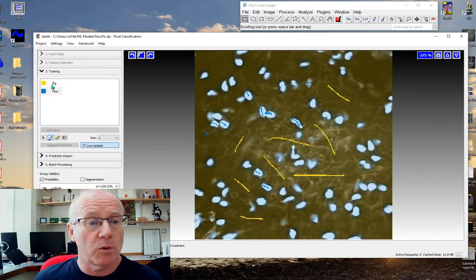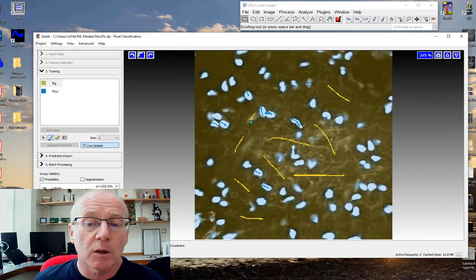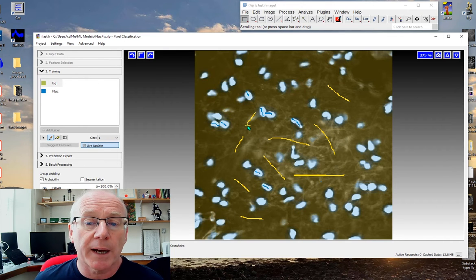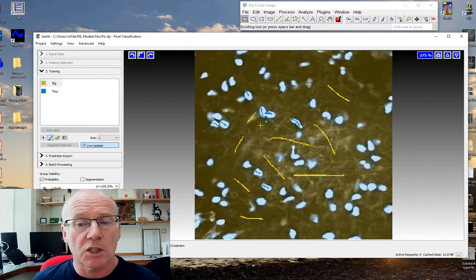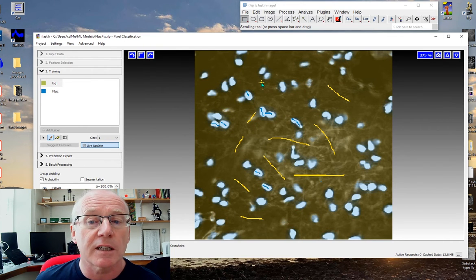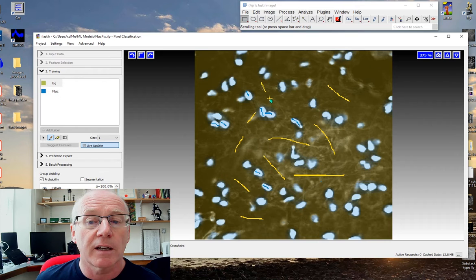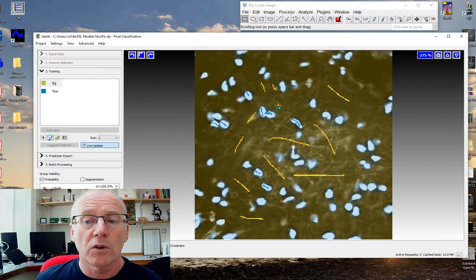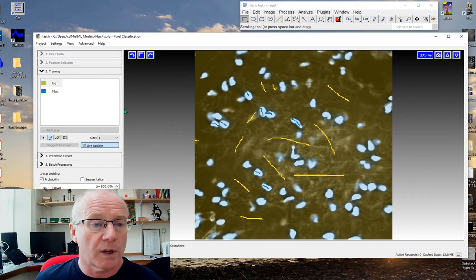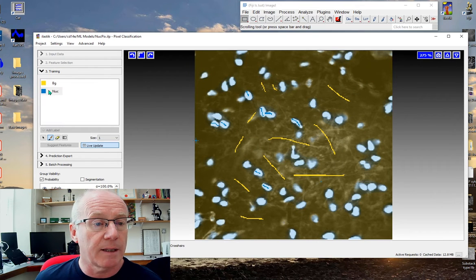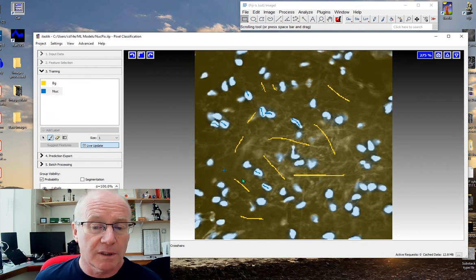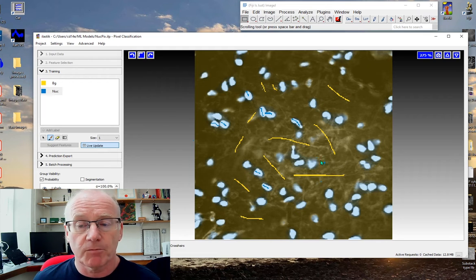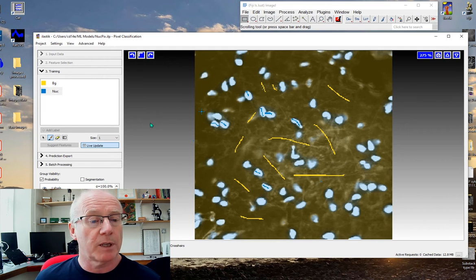If I was to just help it a little bit and say now that's background, you'll see it's changed very slightly there. The more you add in labels then the more accurate it becomes.